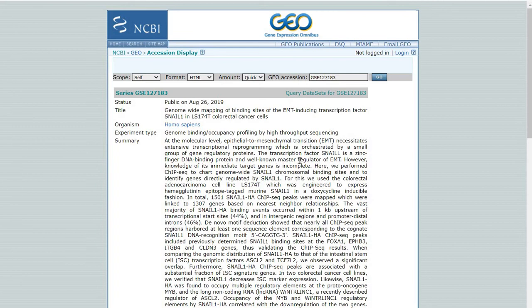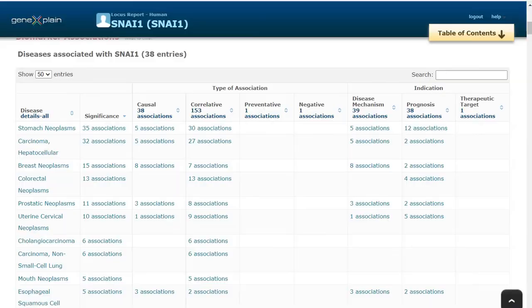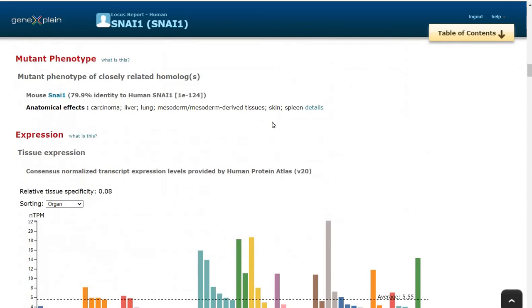Also, we would like to highlight here that the dataset GSE127183, which we are analyzing in this series, also uses the colorectal cancer cell line.